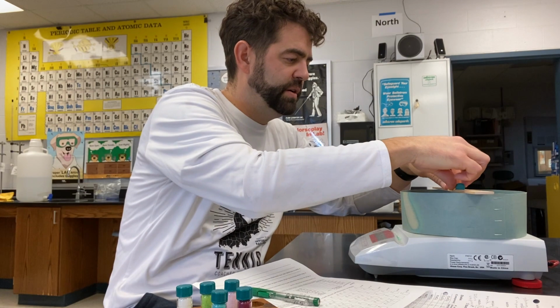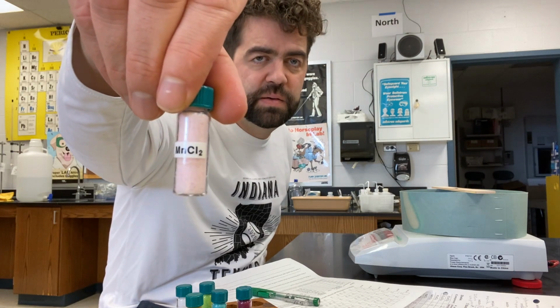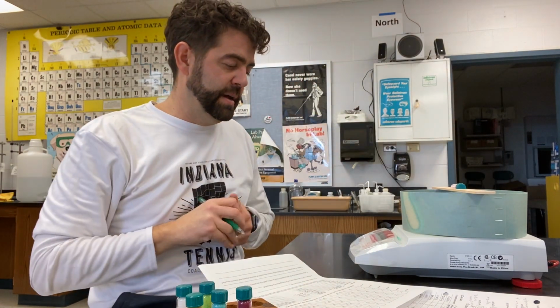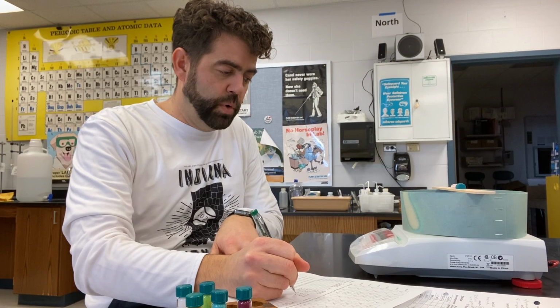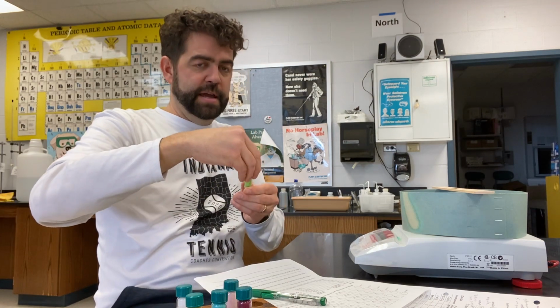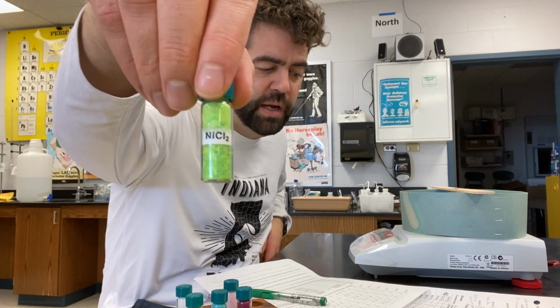These numbers are good. I'm doing a good job. You never know, right? Manganese, MnCl2, going right in order. I'll put that on there. And okay, that's a little bit larger, 0.50. Nickel, cool color there. Green.